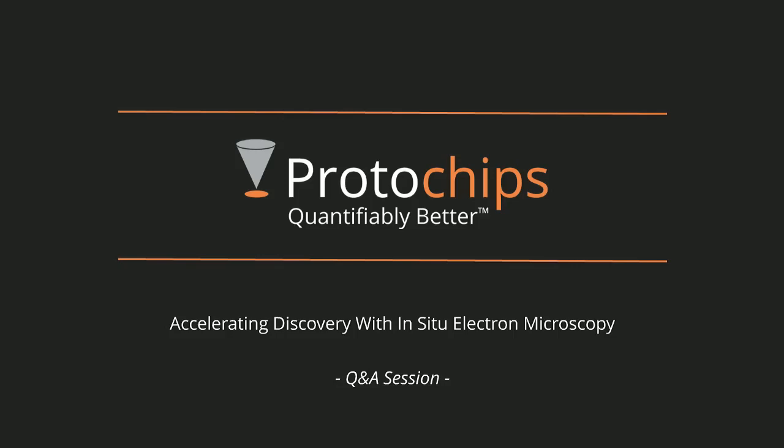Yes. So I didn't cover that today, but the fusion system does enable electrothermal measurements. Just offhand, we've had some customers publish work in the research areas of field-assisted sintering. That's heating ceramic particles up to high temperature and then seeing how they agglomerate as a function of electrical field. We've had some customers look at ferroelectrics and piezoelectric materials. Those are temperatures that have phase transformations that are correlated with electric field and high temperature. We've had a few individuals look at memory devices or nanowire type applications.